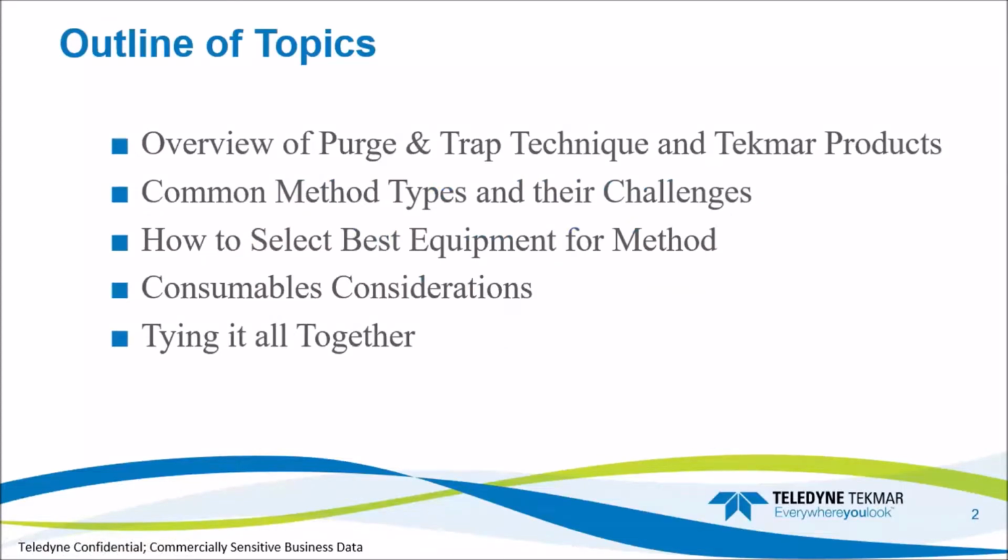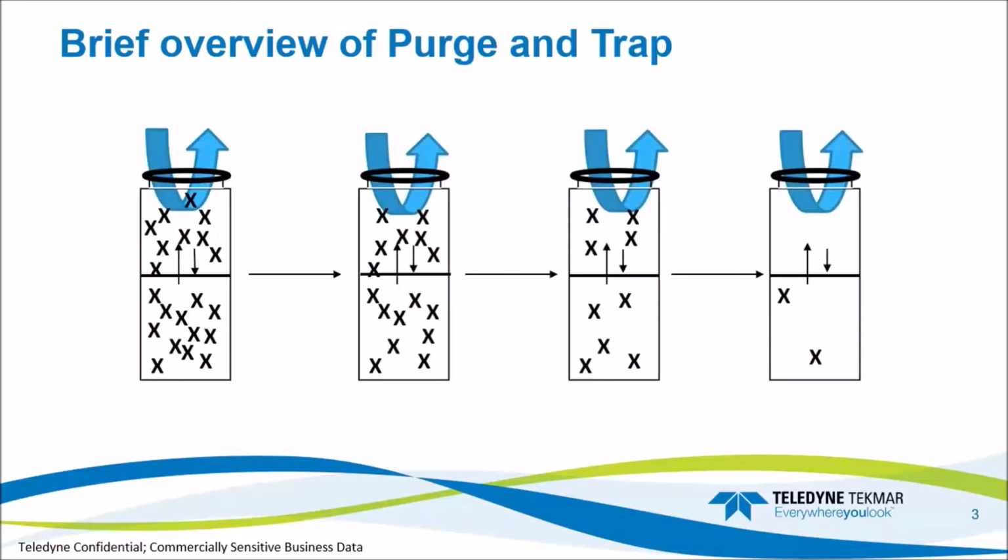Again, we'll go over our quick overview of purge and trap, our common method types and their challenges, how to select our best equipment, consumables considerations, and then we'll tie it all together at the end. So let's start this slide over. So how purge and trap works.